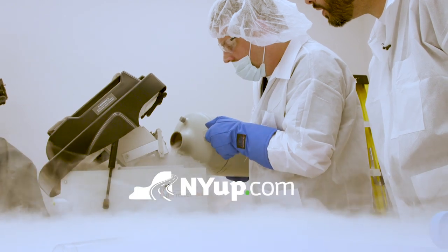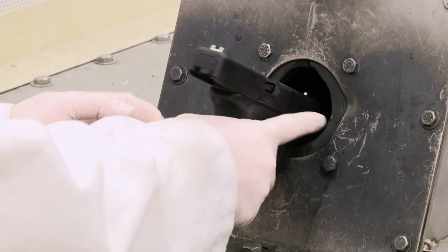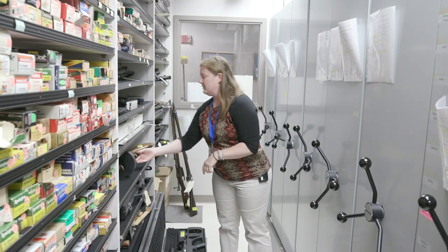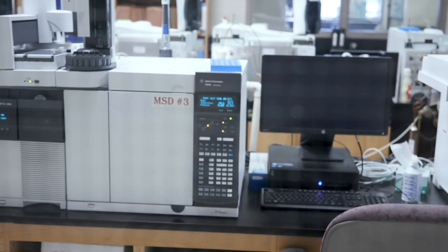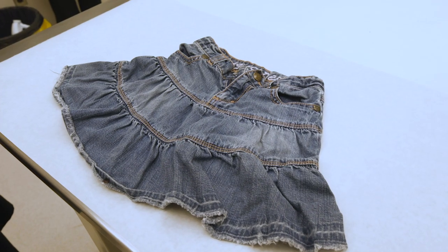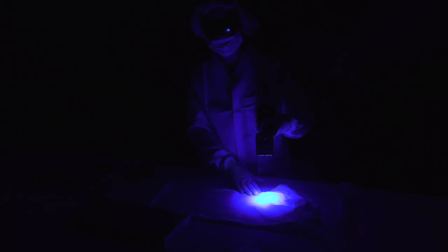Crime never rests in New York State, but neither do the New York State Police Forensic Lab investigators digging to solve it. In 2018 the lab produced 13,000 reports on 14,000 cases from over 30,000 pieces of evidence.